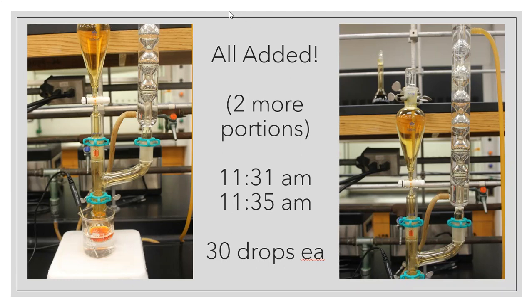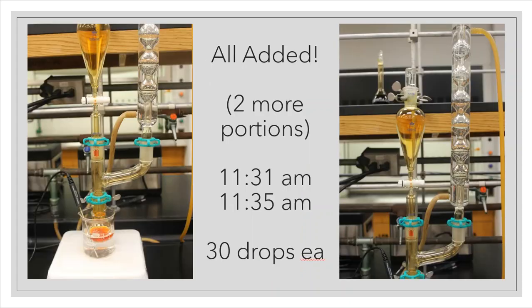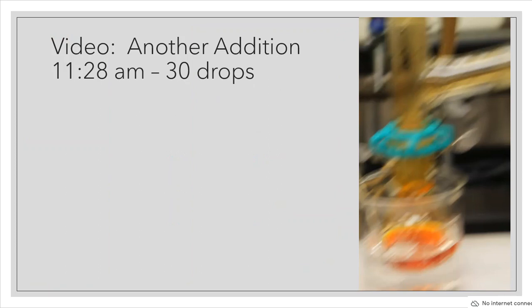All right, so I think that I preempted that slide with this one, so these actually should be switched. This fourth portion should have happened at 11:24. So just bear with me here for the mistake. This happens at 11:24, 30 drops. Then two more portions were added. This was 11:28, which is the timestamp on that video. That was not correct. And then this should have been 11:31. So another portion of 30, a portion of another 30, and then the video, which should have happened at 11:35.